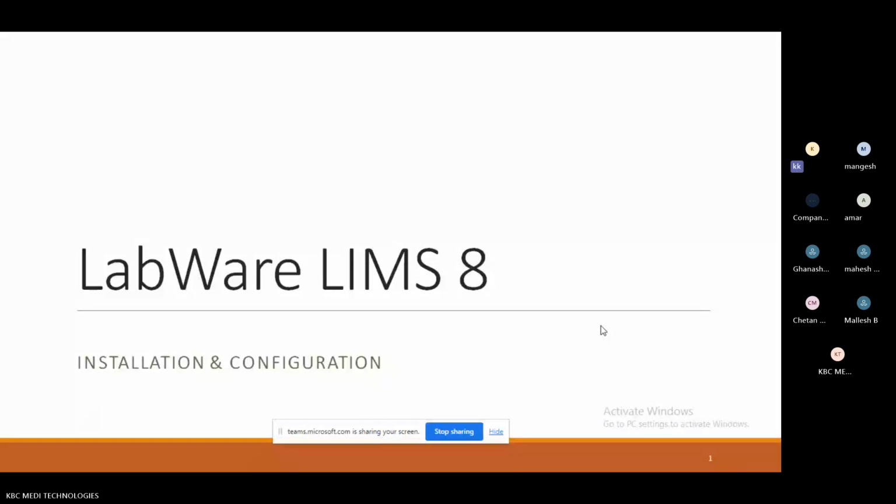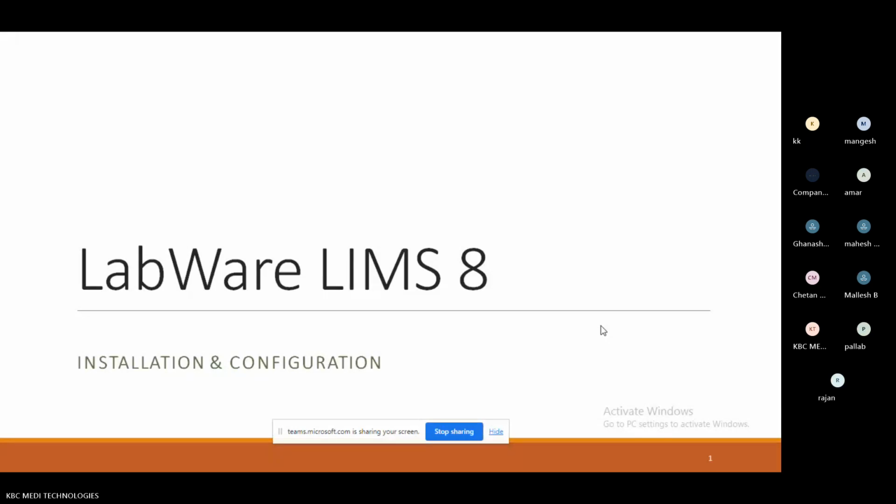Okay, everyone. I hope you all are aware that today we are going to discuss some demo topics related to Labware LIMS. So I'm going to discuss Labware LIMS today. I'm not going to discuss a specific version. Why am I telling this? Just I am going to discuss Labware LIMS.